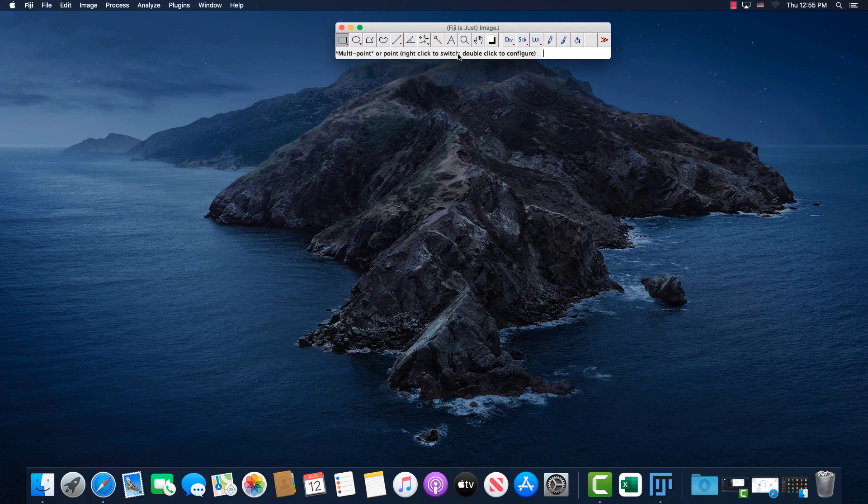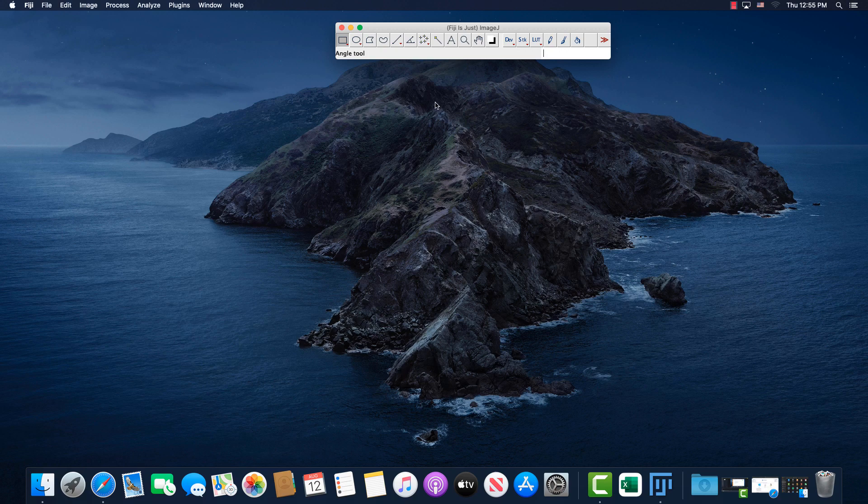But you can say yes. Usually I just say remind me next time, because I don't want to be bothered with updating every single time. But if this is what you get, you have ImageJ working, and you can be confident that you're ready to go with ImageJ.